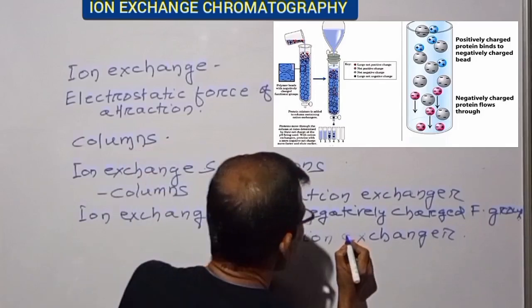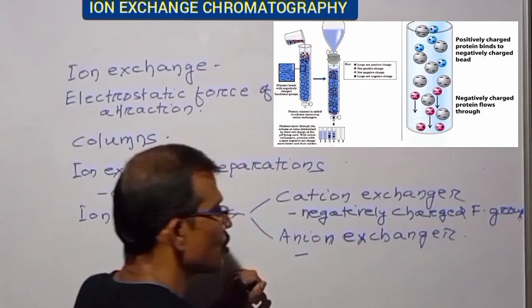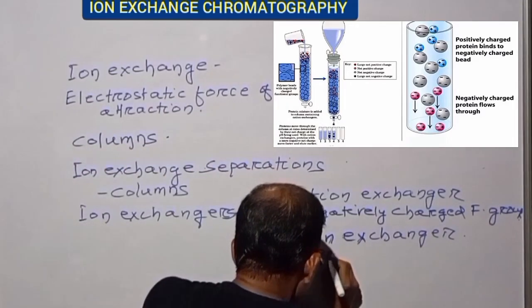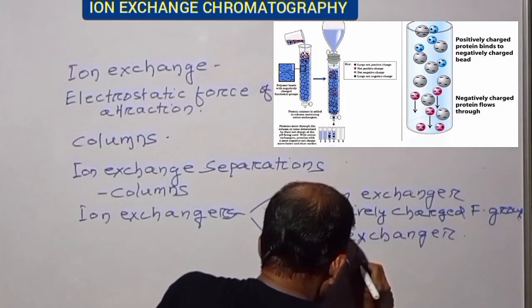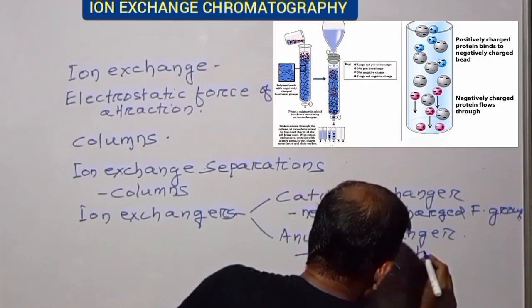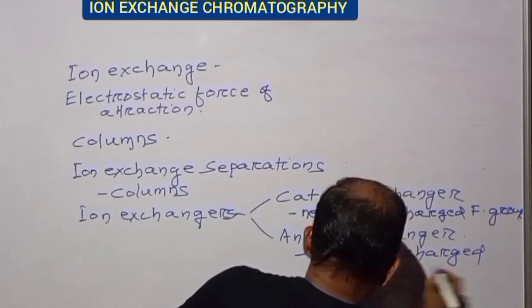Whereas in case of anion exchanger, the inert support medium is bound to positively charged functional groups.